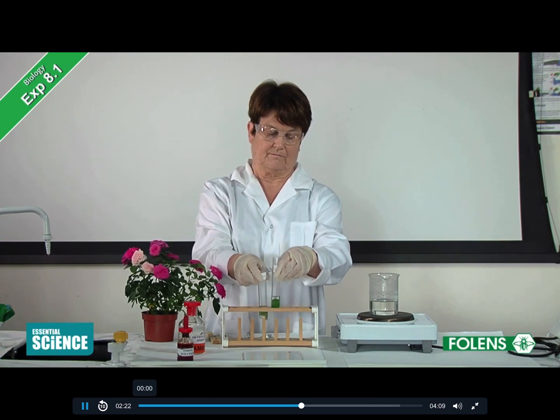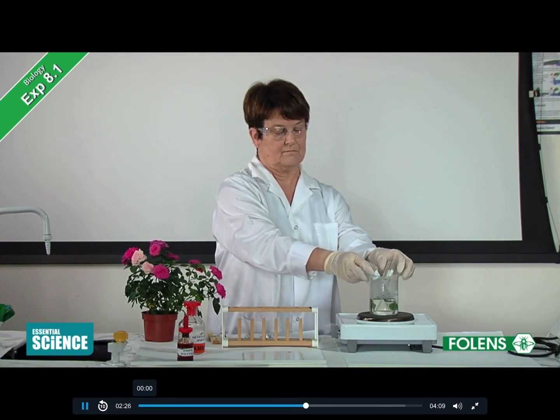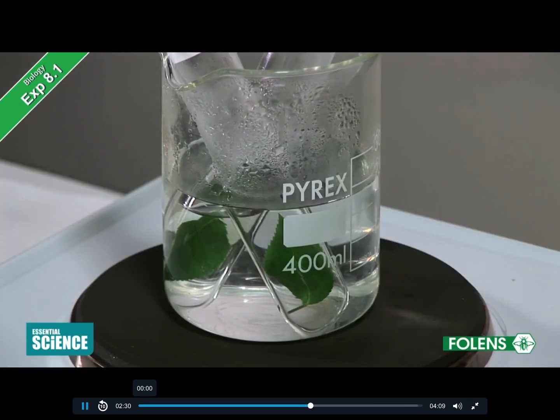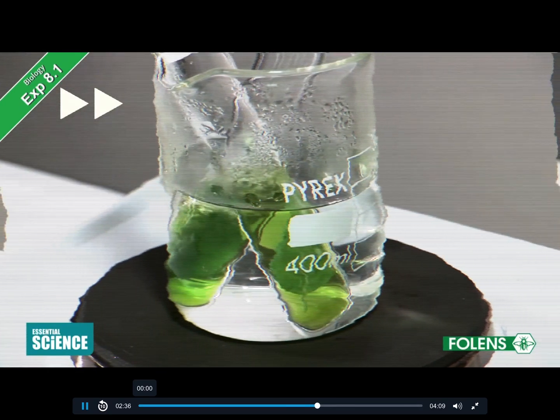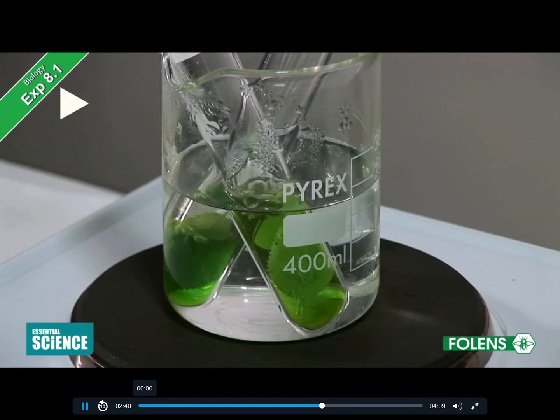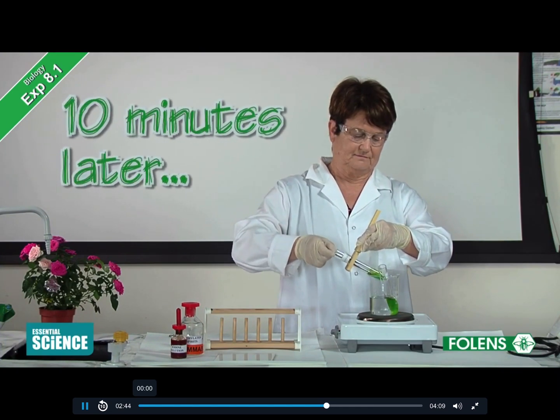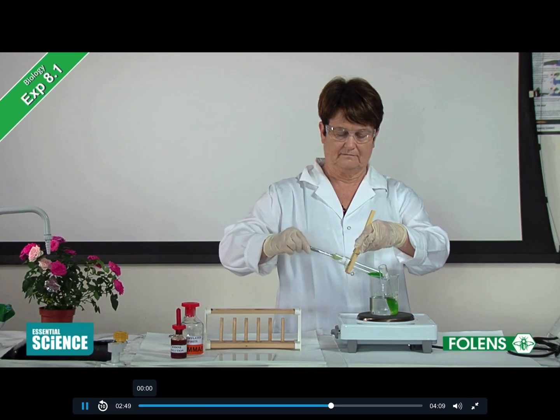The test tubes with the leaves are then placed in a hot water bath for 10 minutes. This is done to remove chlorophyll from the leaves. After 10 minutes, the leaves are removed from the boiling tube of alcohol and washed with some hot water.